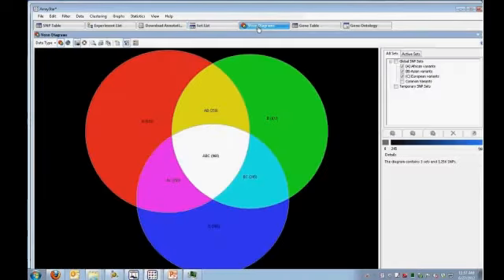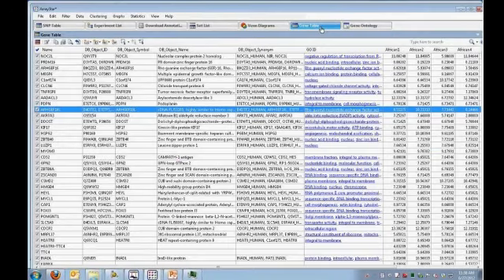And that's where we have Venn diagrams. In this case, we have a simple three-condition Venn diagram. We can actually do a dartboard diagram. If I have more than three, I can make additional Venn diagrams. And I can select any part of the Venn diagram and do analysis just on those subsections. And so if I want to look at the SNPs that are in common, I can select the ABC and create a gene table of that. And here's a list of the genes that are involved with all the SNPs that are in common.